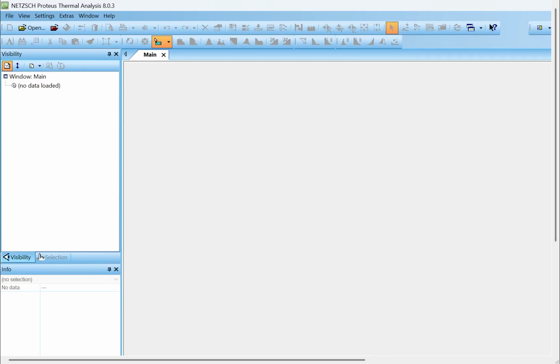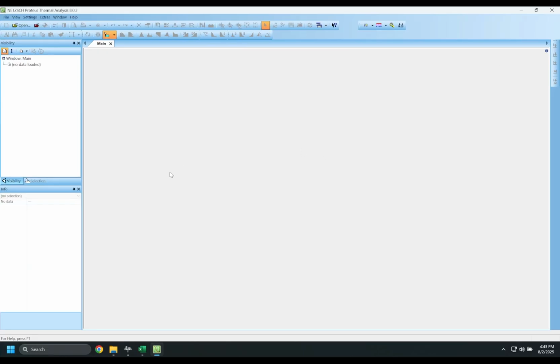Hey everyone, today I'll be doing a short little video on how to use Proteus Analysis to analyze data collected in the Netzsch STA. So this is the screen showing Proteus Analysis.